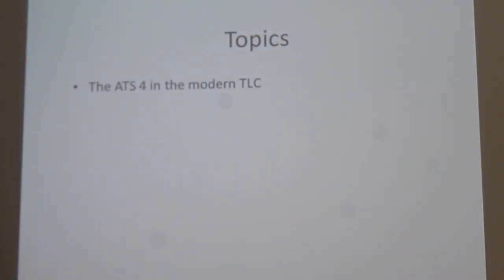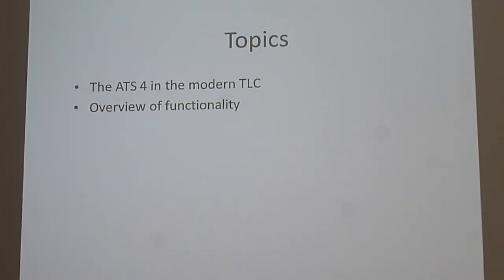First, that's normal. Always we have the position in the modern HPTLC, then the overview of the functions. The block diagram is my favorite always, because I have to explain what we are doing and what the devices are, how it works from the schematics. Then we also have to test in the service modes. Test mode is mainly only to test the motors and the pneumatic parts. And service mode is mainly for adjustments.